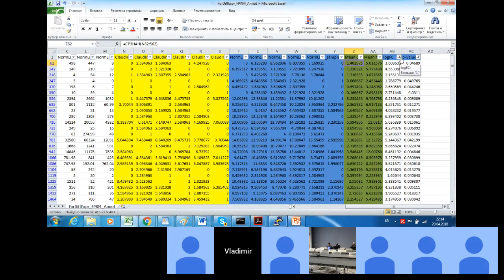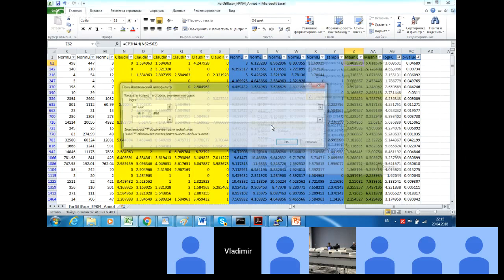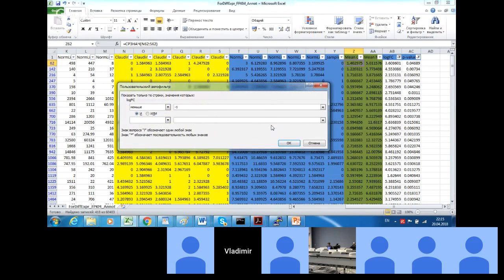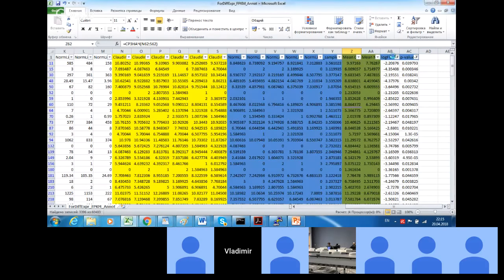If we want to have down-regulated genes, we simply select genes with sufficiently negative logarithmic threshold, for example, log fold change lower than -1. So if there are too many genes in this list, then we can apply harder thresholds.